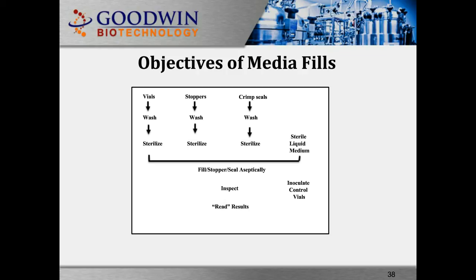At the end of 14 days, some of the control vials have to be inoculated with the microorganism in order to confirm that nothing was compromised during the fill, and to identify if there is any contamination during the fill.